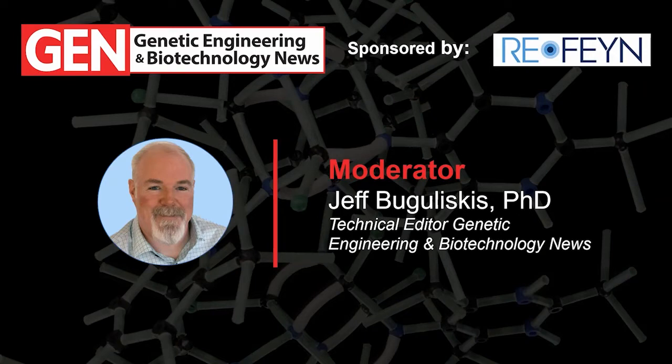However, what many of you may not be aware of are some of the challenges associated with manufacturing AAV at scale, in particular, quantifying the ratio of empty and full AAV capsids. Currently, most existing methods are not quick and simple enough to be employed throughout the manufacturing process, a scenario many scientists would like to rectify.